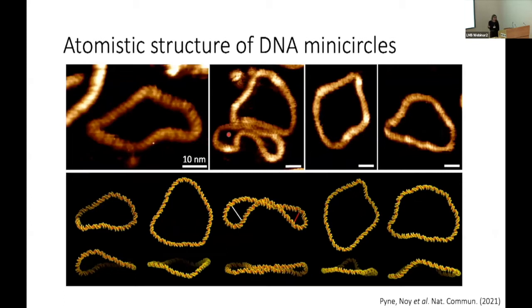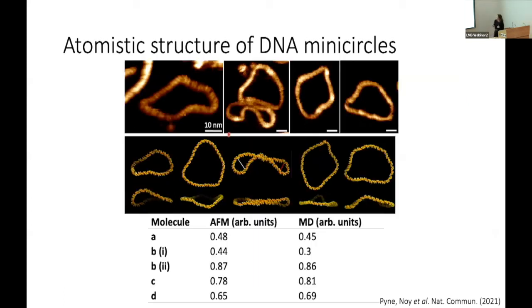But because we're biophysicists, not photographers, we try and quantify this to some element. And the way we did that was to use the aspect ratio, because what we've done is make a rigid planar molecule. So as you twist it or compact it, it basically gets more compacted and it gets longer and thinner. So you can think of it as old TV to cinema screens. So that's how we're classifying these. It's by the aspect ratio.